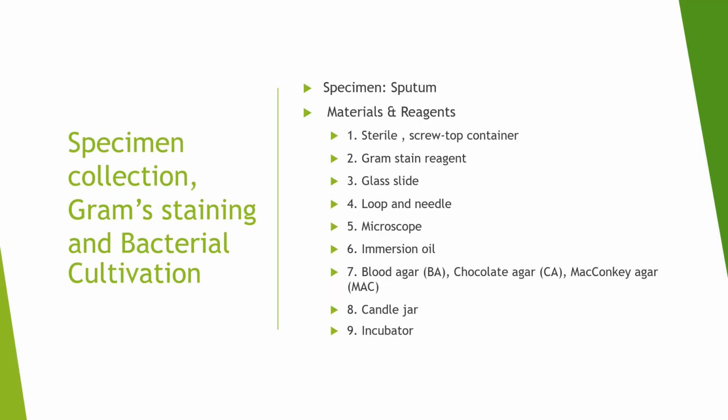So our specimen today is sputum. Here are the materials and reagents that we're going to use for today's examination. We have this sterile screw top container, and we have the gram stain reagents, glass slide, loop needles, microscope, immersion oil, and the agar that we're going to use, which are blood agar, chocolate agar, and MacConkey agar, candle jar, and incubator.